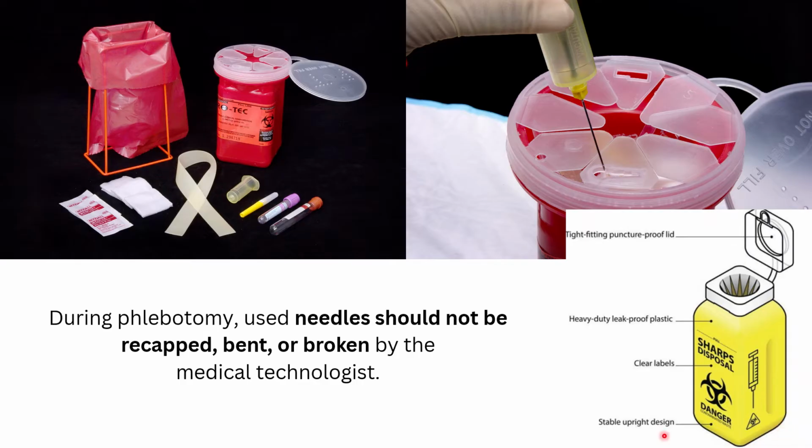So after you extract blood from your partner, from your classmate, or from your patient, you are expected to throw all those needles, not recapped, not bent or broken, inside this sharps disposal container.